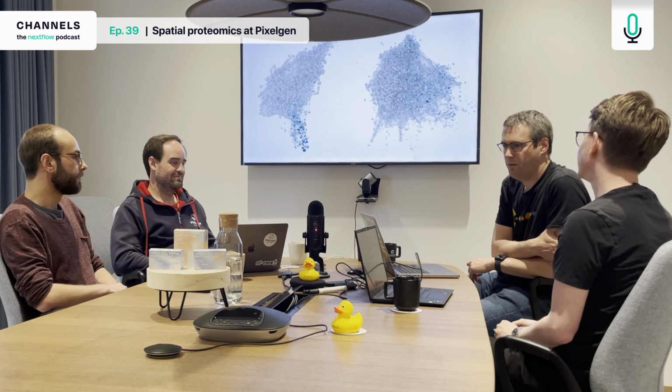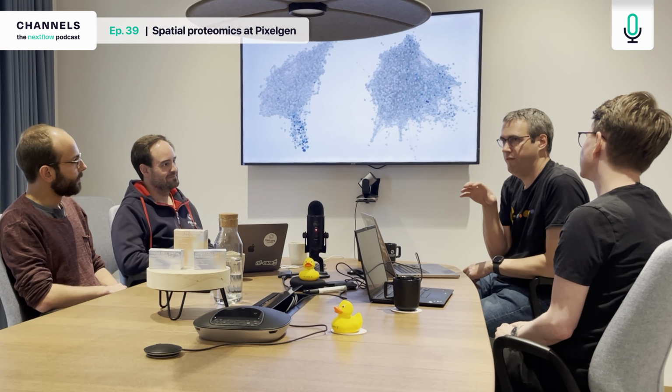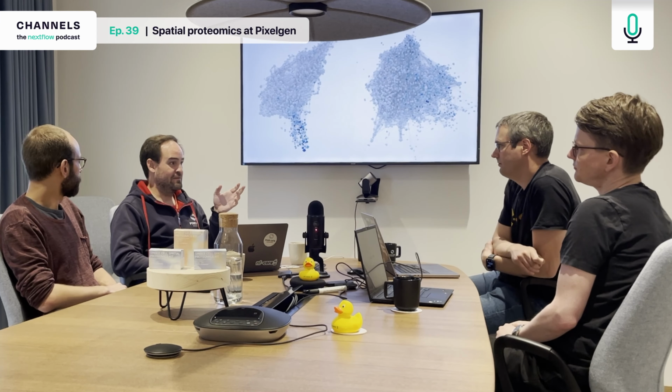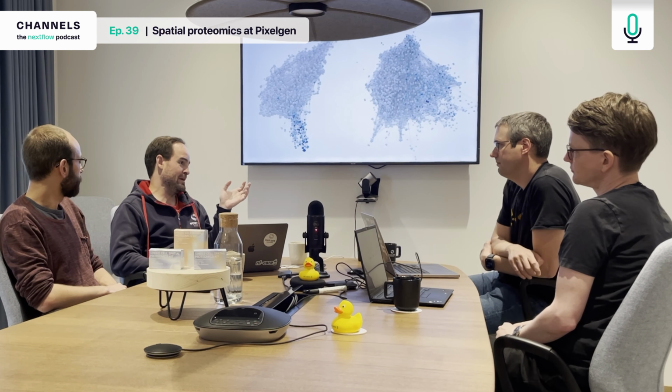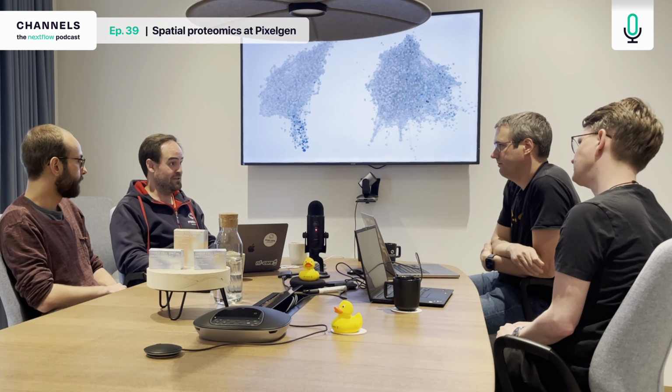So very cool. And with such high multiplexing, you can presumably have a kind of discovery-based rather than hypothesis-based experimental model. Exactly, yes. So many of these receptors were described in different papers, but in a single experiment that we ran in a couple of weeks, we could recapitulate most of the literature that has been described.